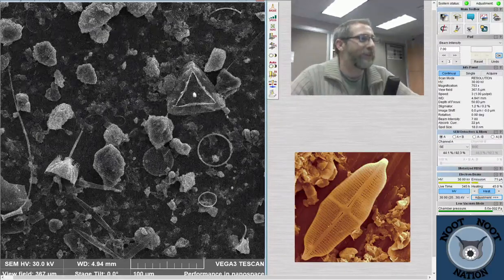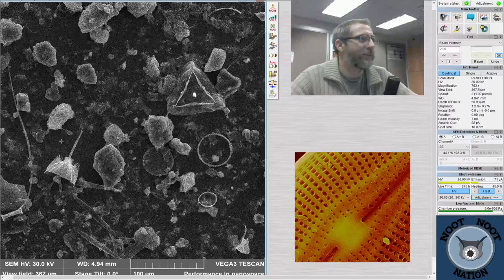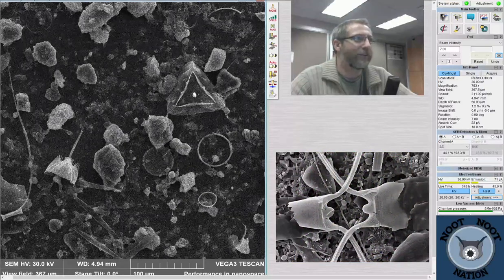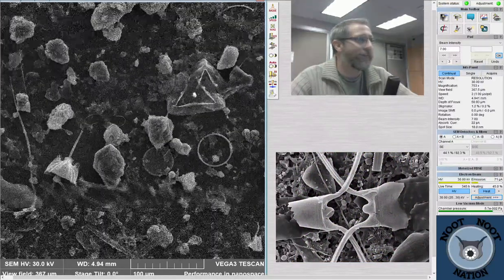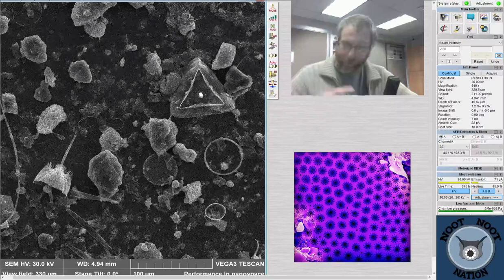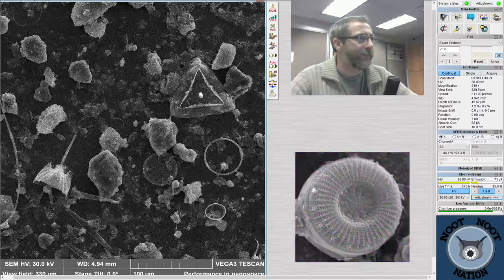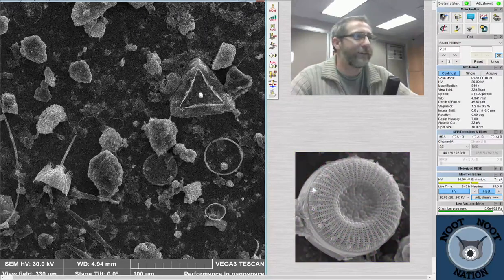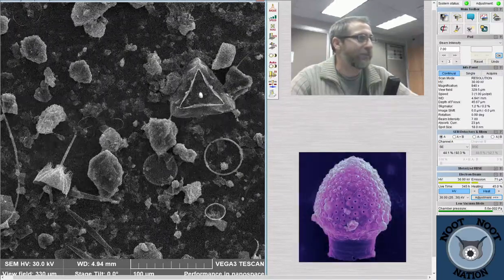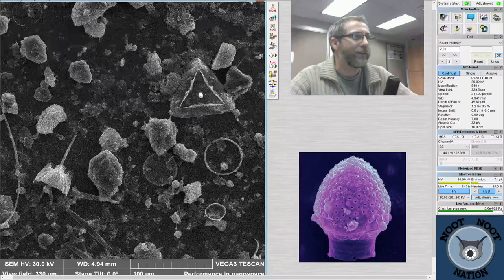So earlier we looked at something that looked like this, which is Ditylum. And this is a nice view because you can see Ditylum in girdle view or side view right here. And here's a Ditylum looking down on it from the top. Because of this, you can get a really good sense of the shape of the diatoms. They're triangular when you look at them from the top, like a map view. And that long tube that you're seeing is this thing right here. This fringe of eyelash looking things on the side are actually right here. They make this sort of triangle. And then the shape of the diatom is this sort of triangular prism, like a column. And you can kind of see that here.